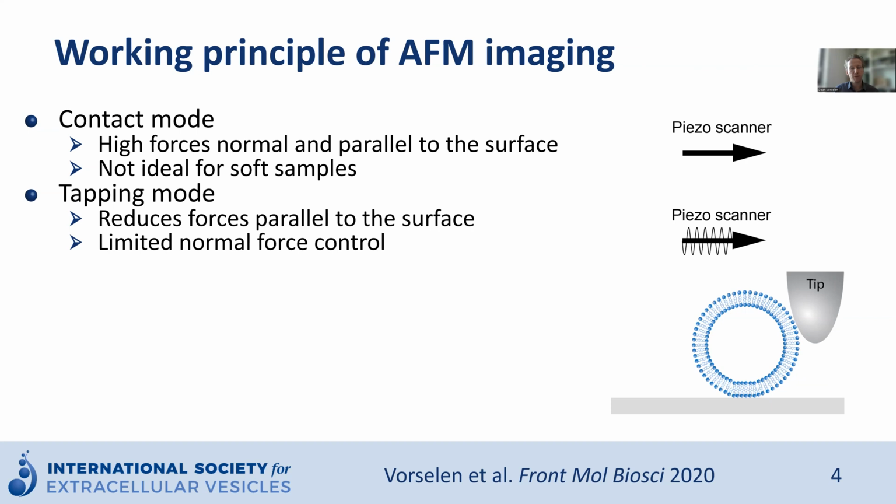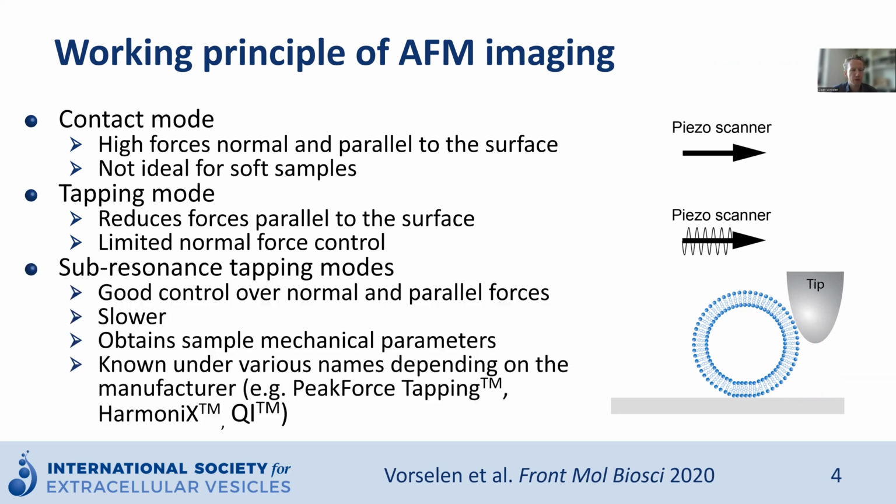So overall, this mode results in much lower forces between the tip and the sample because the contact time between the tip and the sample is much lower. And this also affects the forces parallel to the surface because the tip is mostly moved sideways to go to the next pixel while it's not in contact with the sample. However, maximum exerted forces are still not very well controlled in this imaging mode.